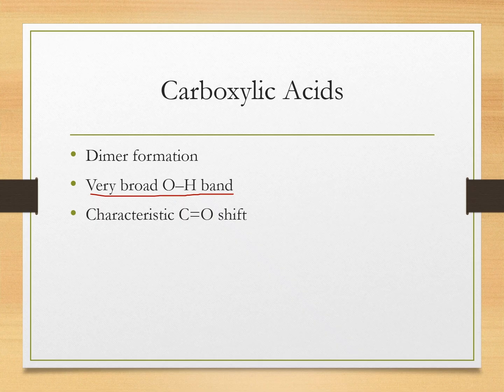The C=O stretching frequency shifts from 1750 to 1710 per centimeter due to hydrogen bonding. These two features are diagnostic for carboxylic acids in dimer form.